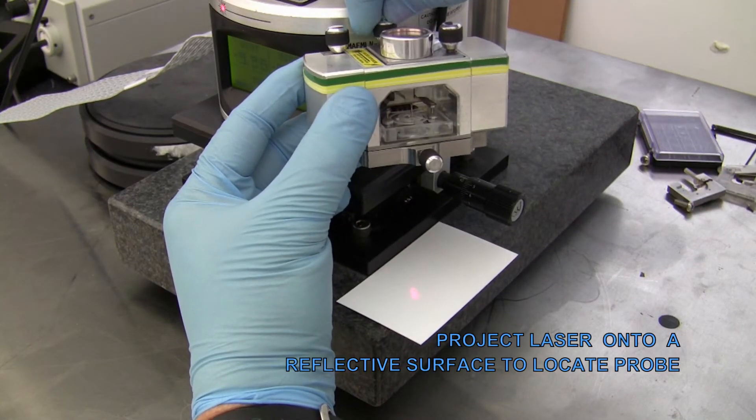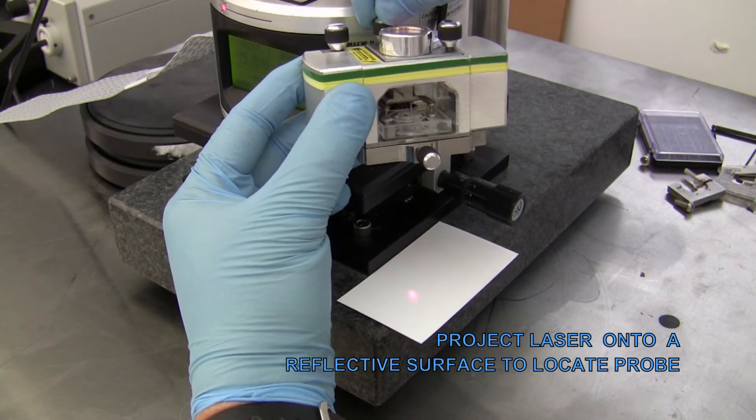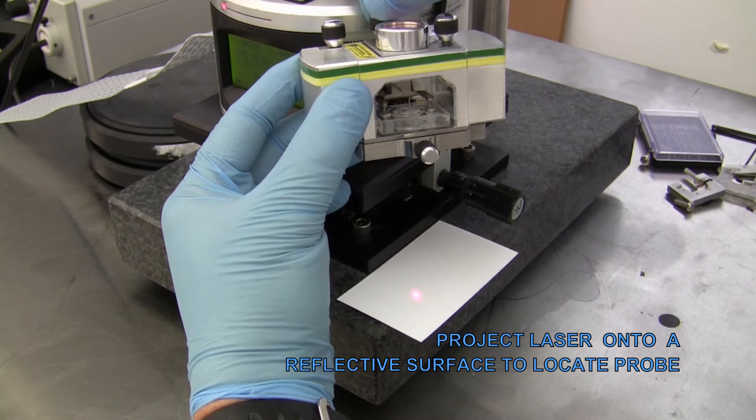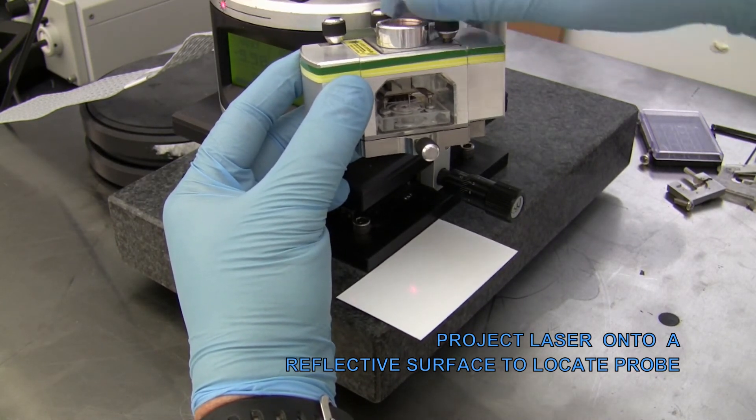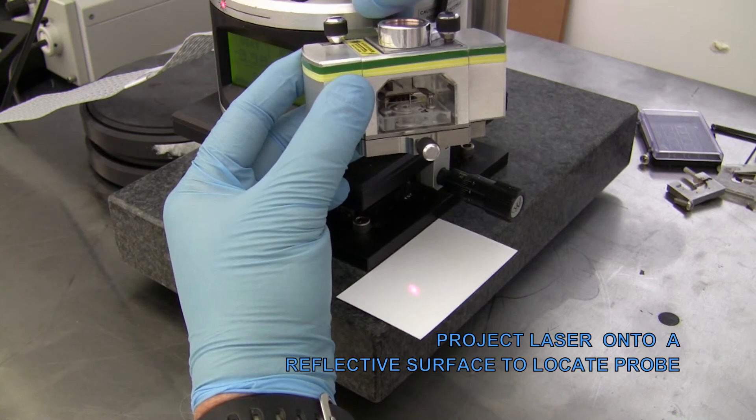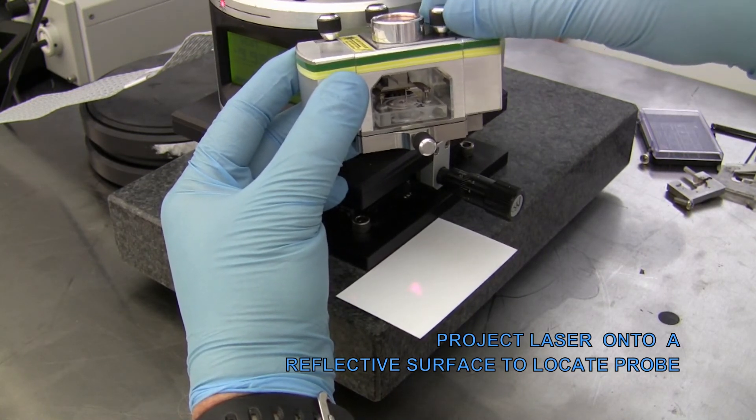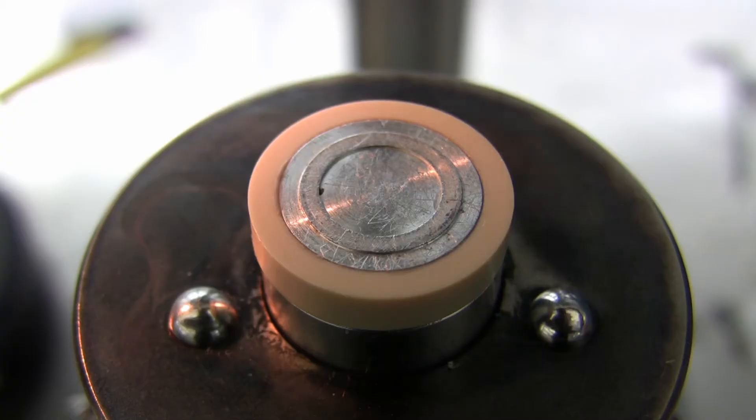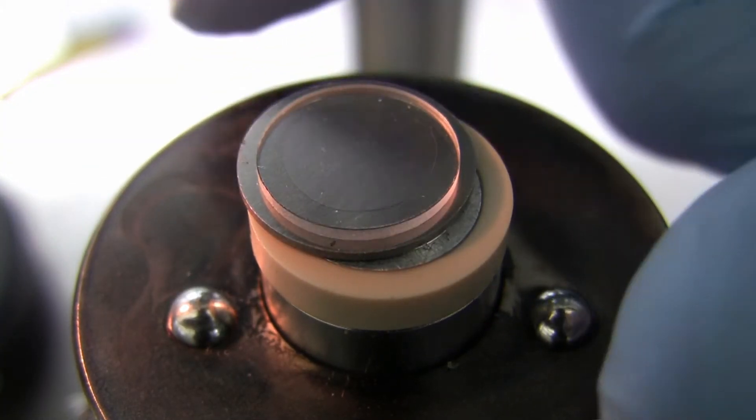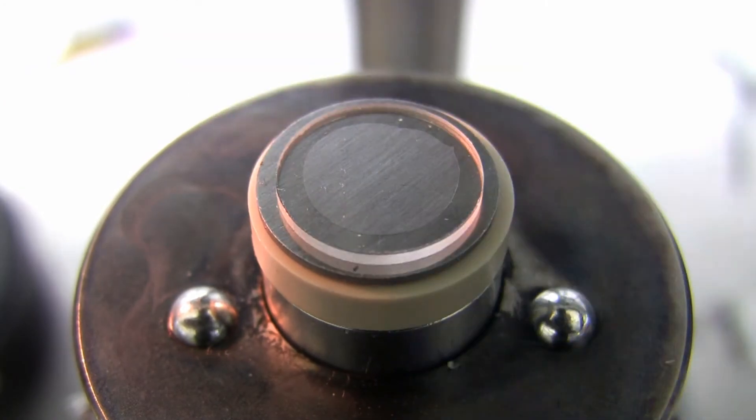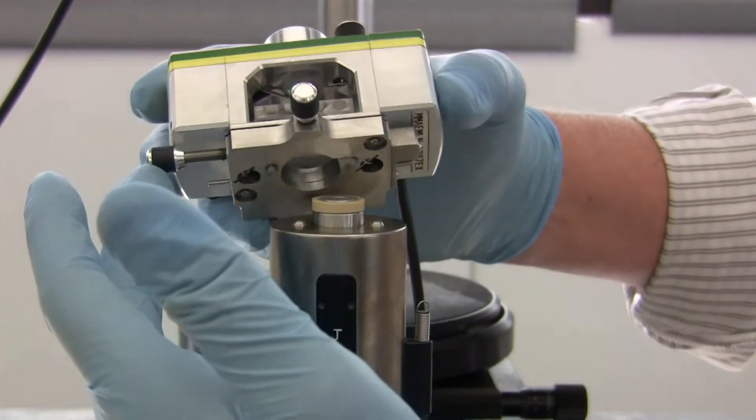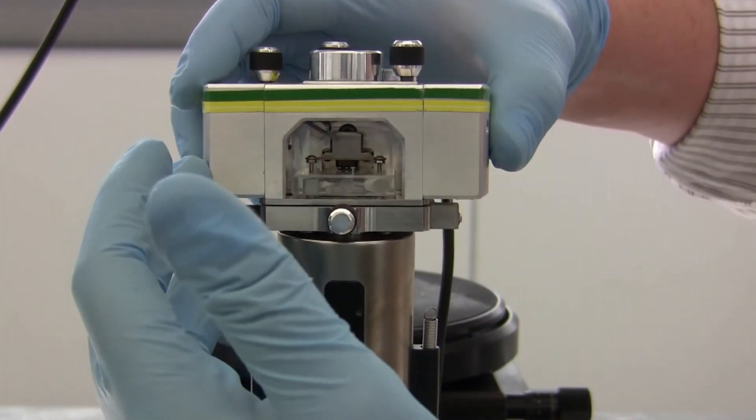At this point, it may be useful to perform a preliminary alignment of the laser using the shadow method to find the probe. Then place the sample disk onto the scanner's magnetic mount. Place the head onto the scanner body and attach the two tension springs.